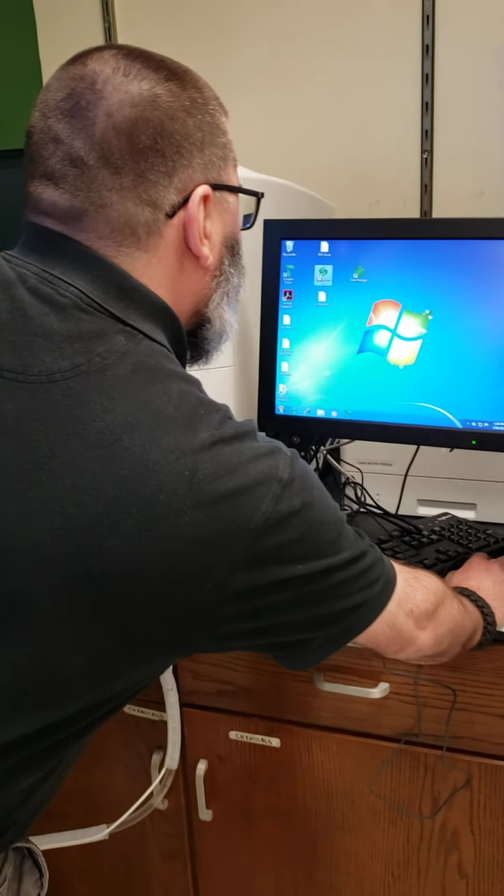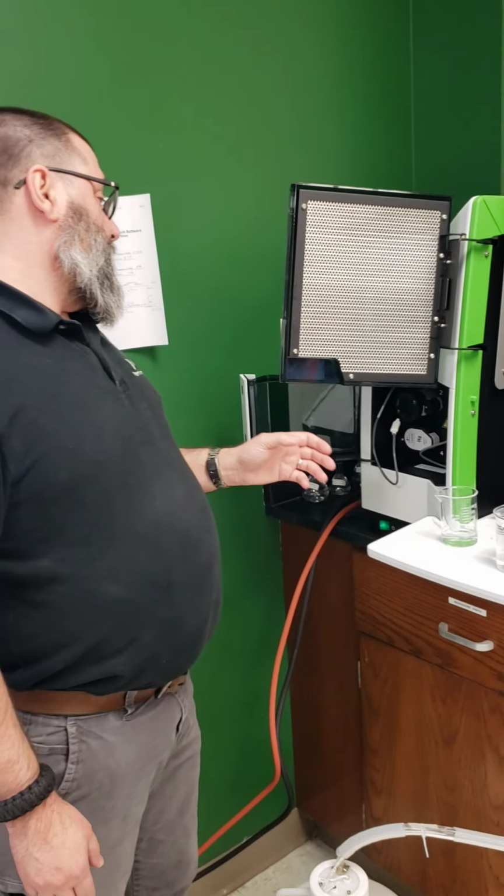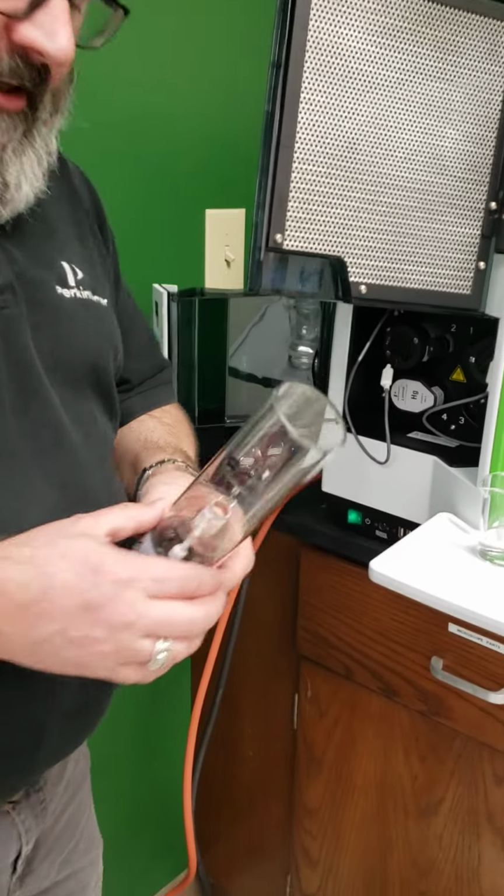So what happens in atomic absorption spectroscopy is we have a lamp. This is a copper lamp.